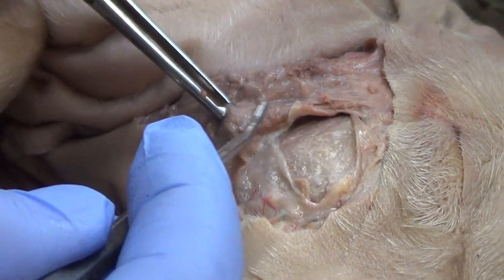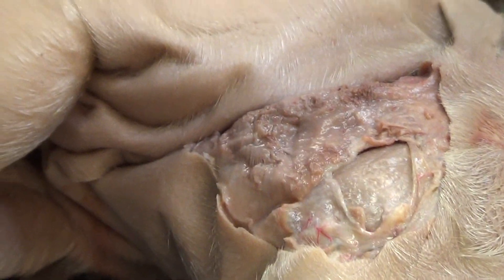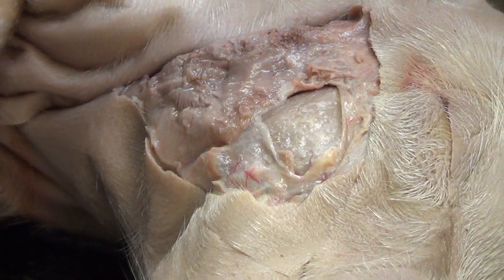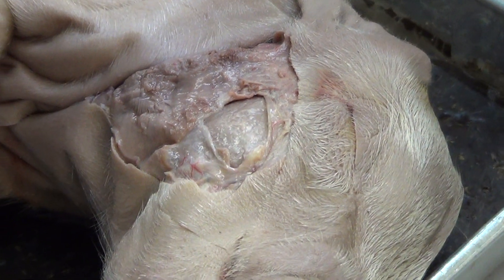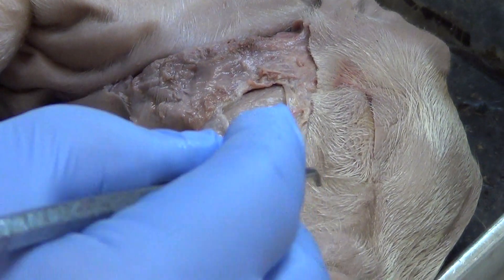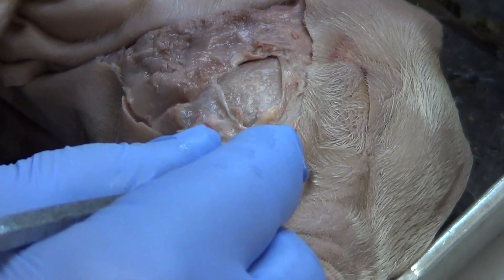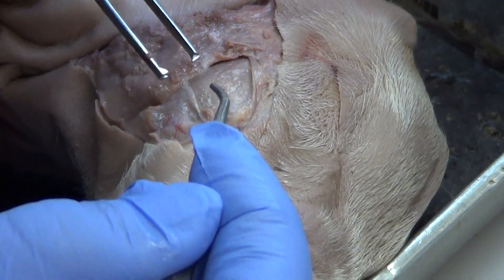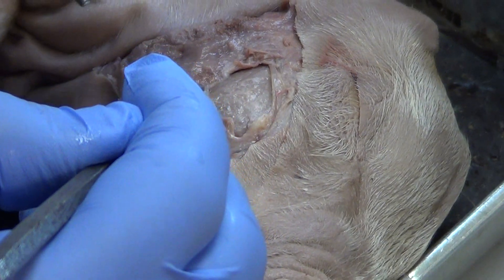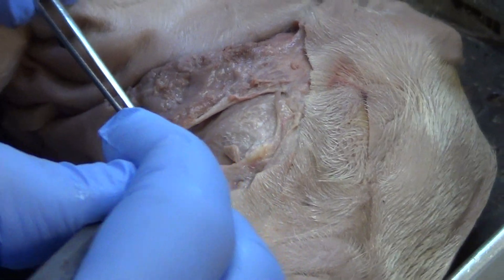Believe it or not, this entire structure right here is the parotid gland — your main producer of saliva. It will send saliva into the mouth on the parotid duct to that upper second molar. That means there's a tube I need to find next, and it goes right underneath the masseter. I'm going to pull up on some of this connective tissue and pull it away — I can actually cut that connective tissue out.